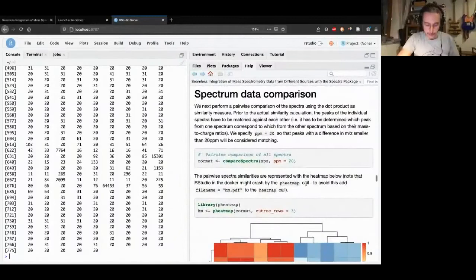Okay, and now I would actually say we make a short break if there are any questions, maybe. Yes, there's just a question from Thomas Naker. Is it possible to have both the raw intensities and the processed, for instance, in percentage, intensities at the same time stored in a Spectra object?